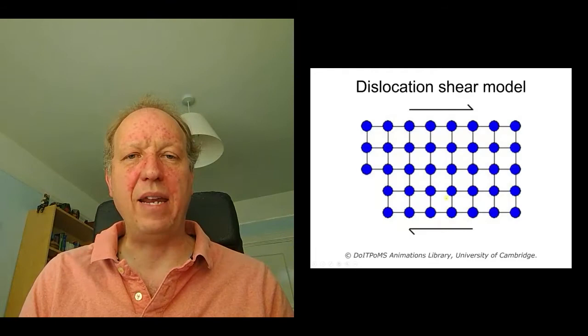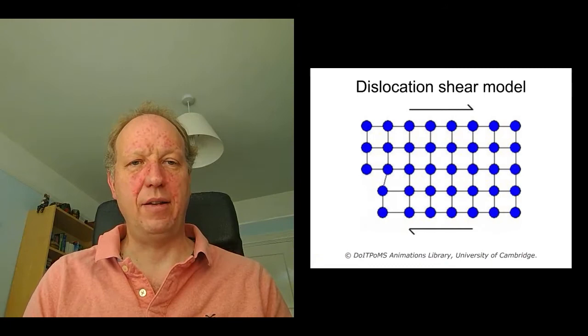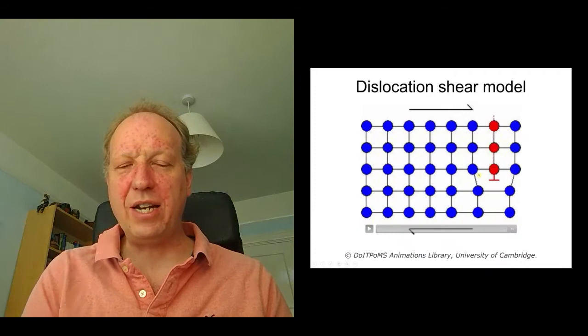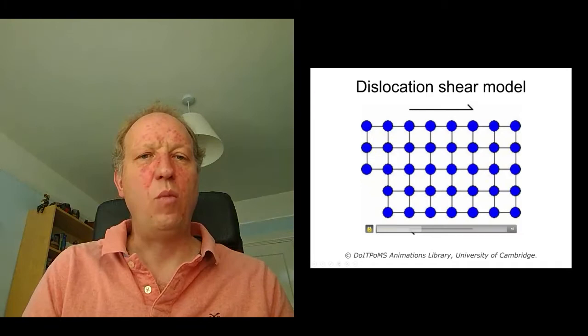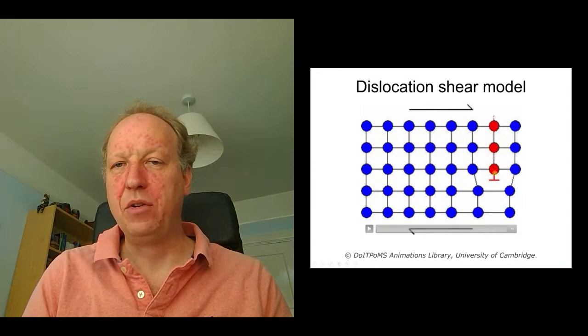It takes a little while to start. Here we go. Now you can see here's the dislocation. Here's the extra row of atoms. And you can see, actually, as this extra row of atoms propagates across the material, we only have to break one row of bonds at a time, not the entire set between these two planes.